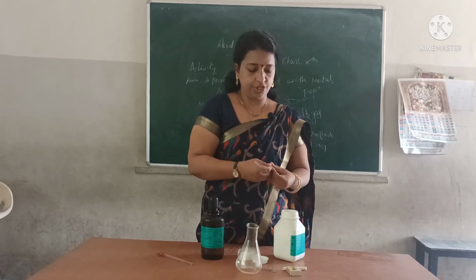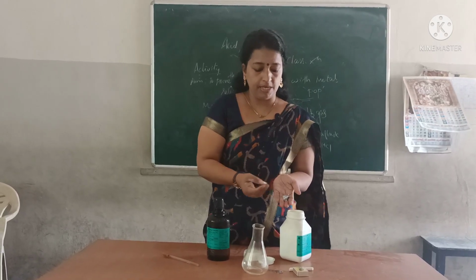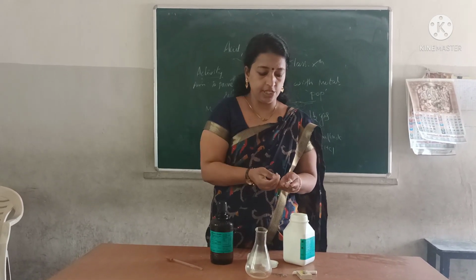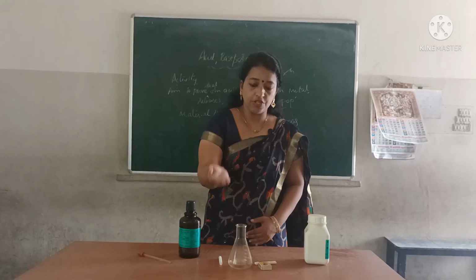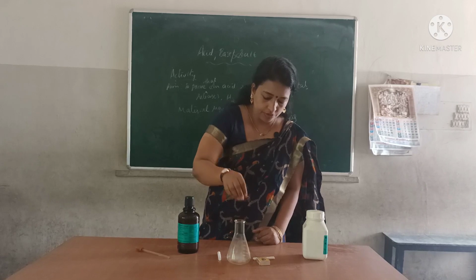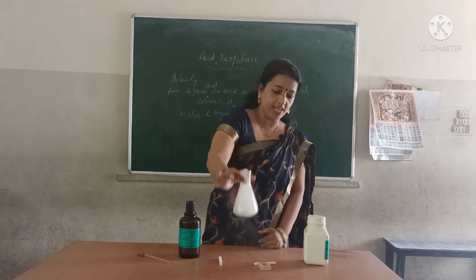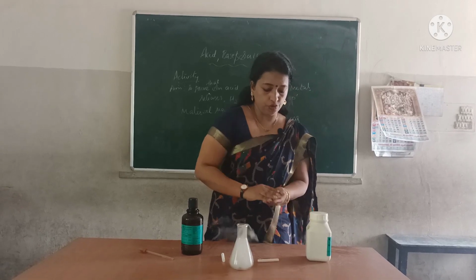These are the zinc metal, a very hard metal. It's a hard metal only. So this is the zinc metal. I have taken some zinc metal and I am going to add it in. You can see some gases are releasing out. Can you see?